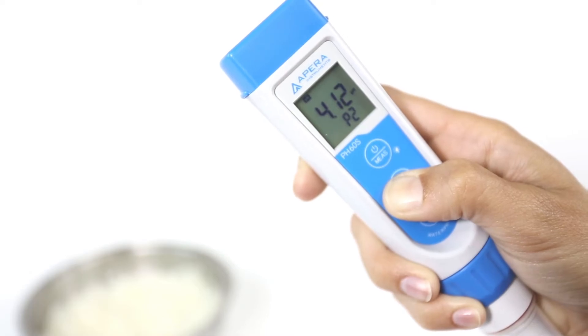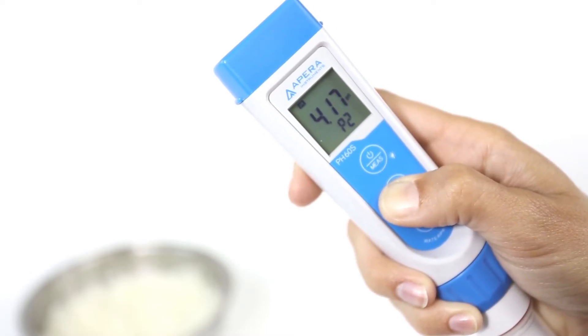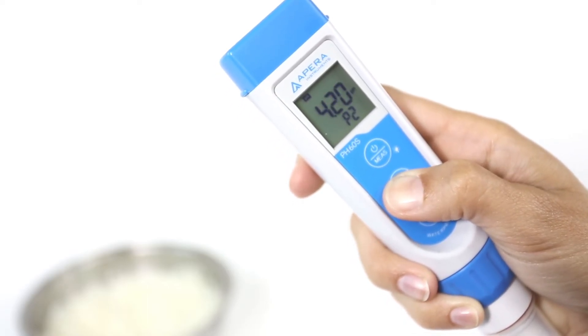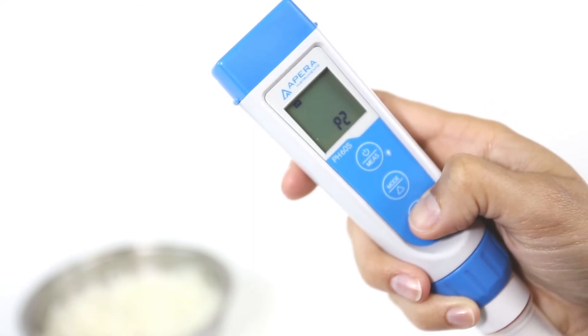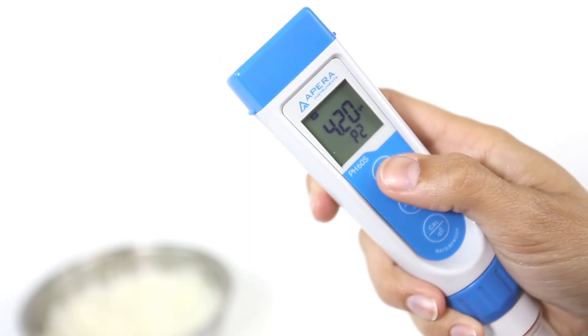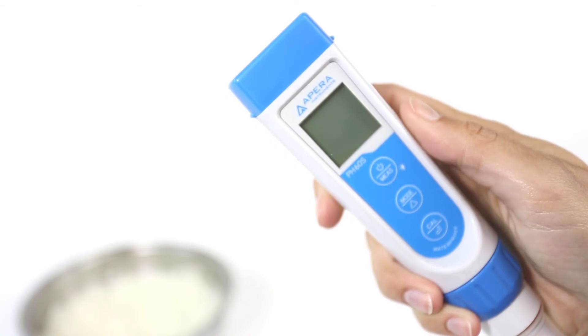You want to adjust it to 4.20. To do this, simply hold the arrow button until it is close to 4.10, then release your finger and tap the button until you arrive at 4.20. Press enter again to confirm the setting — the pH value will stop flashing. Long press the power button to power off.